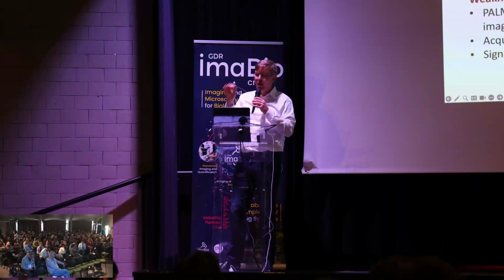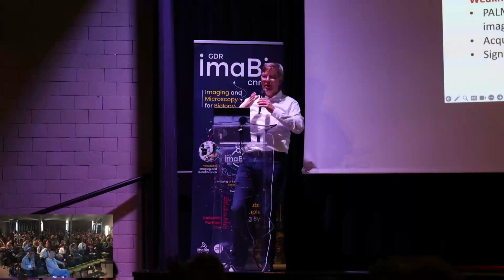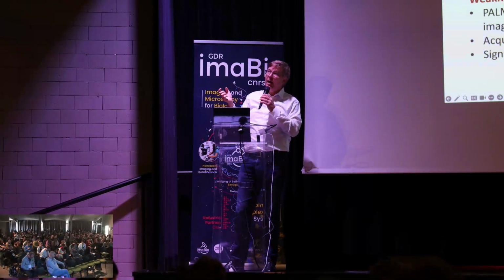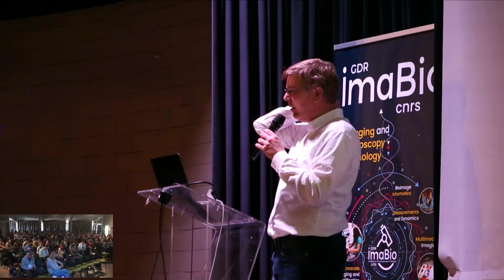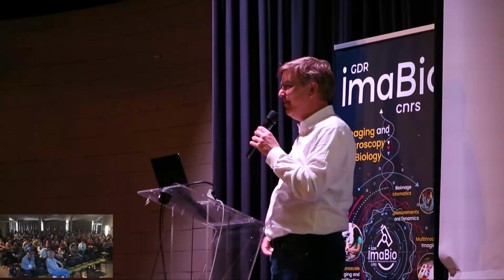We want the transient binding. In FISH, you don't want transient binding; you want this to stick forever. And of course, if it's DNA FISH, you first need to melt your DNA to actually get access to single-stranded DNA. Could you directly bind this to RNA? I think yes. I'm blanking right now if this has already been done, but yes. Okay. Well, Francisco will show it.